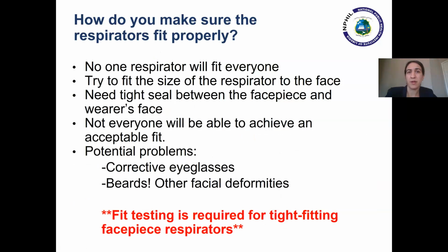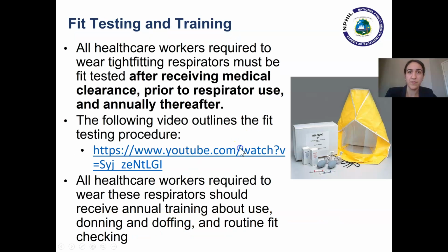So how do you ensure that the respirators fit properly? First, recognize that no one respirator will fit everyone. Most respirators come in 3 sizes, so try to fit the size of the respirator to the face in a way that creates a tight seal. This also means that beards, corrective eyeglasses, and facial deformities might get in the way and cause a poor fit. Not everyone will be able to achieve an acceptable fit. Unless powered air purifying respirators are available, these healthcare workers should not be assigned to work where respiratory protection is required. That's why fit testing is such an important requirement for tight-fitting facepiece respirators.